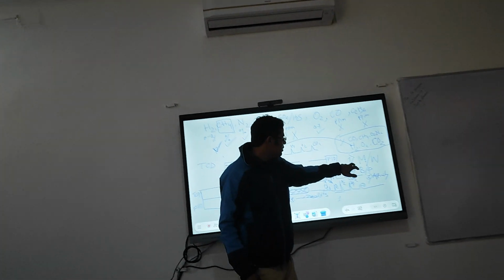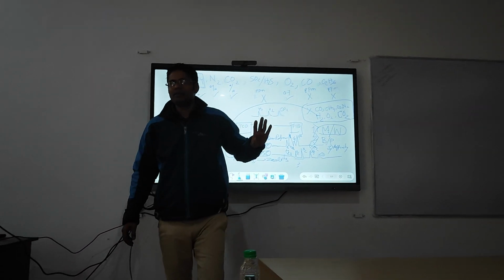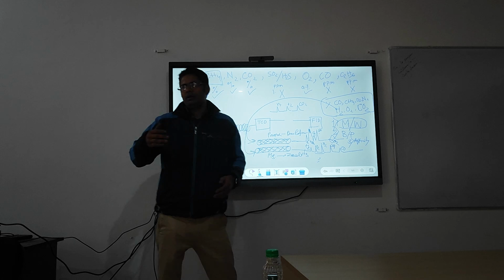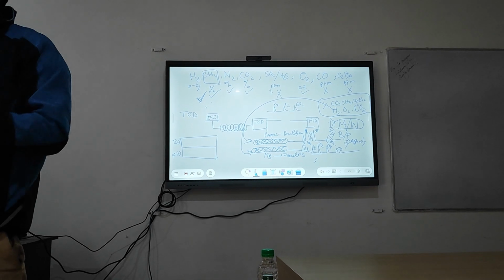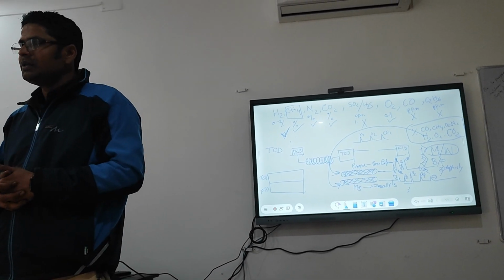That's why I am explaining these two types of columns, because we will go by molecular weight related basic things. For elution, you are getting 6 peaks, so you will definitely say hydrogen will come first, then as madam said CH4, then CO2 as per molecular weight.